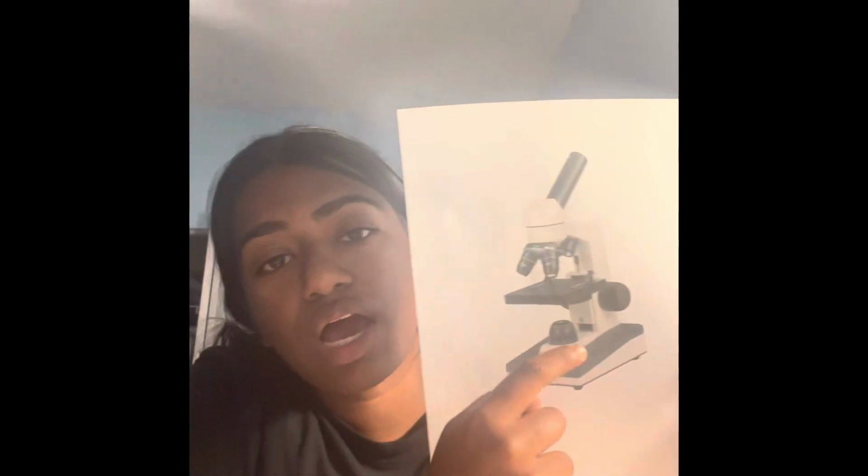And then below that is the stage. This is where you put the slide on the microscope so you can see through the lens. And then next to it, you see there's a stage clip. And the stage clip is important because it holds the slide together. That way you can move the stage up and down or side to side so you could have a better view of the image. Now, if you see right here, this little knob right here is the coarse adjustment knob.